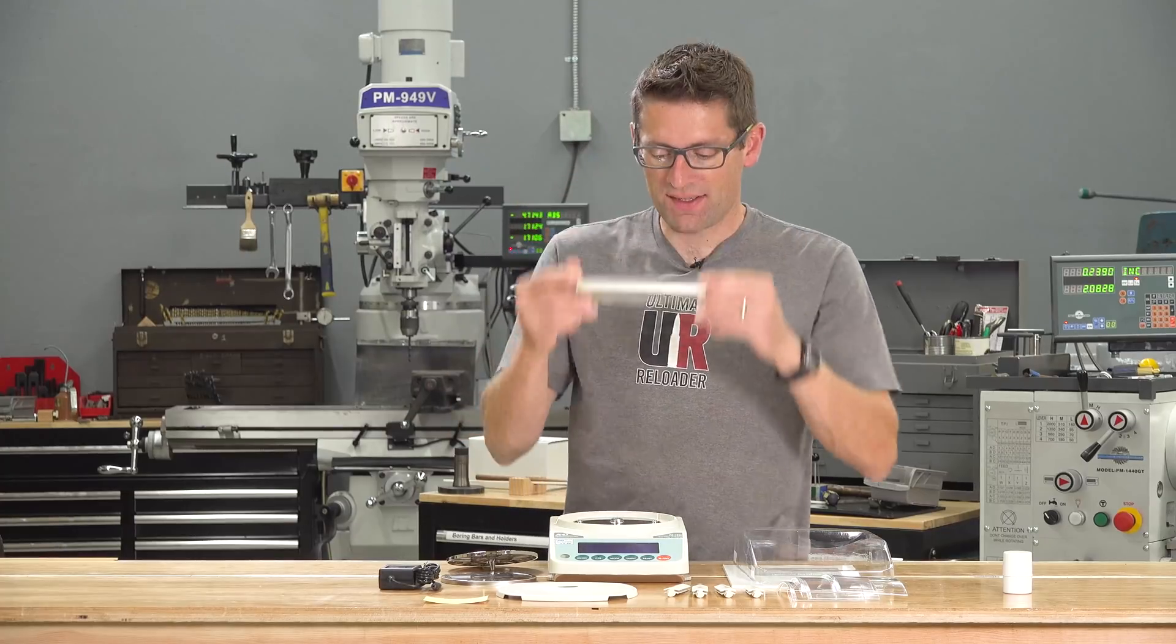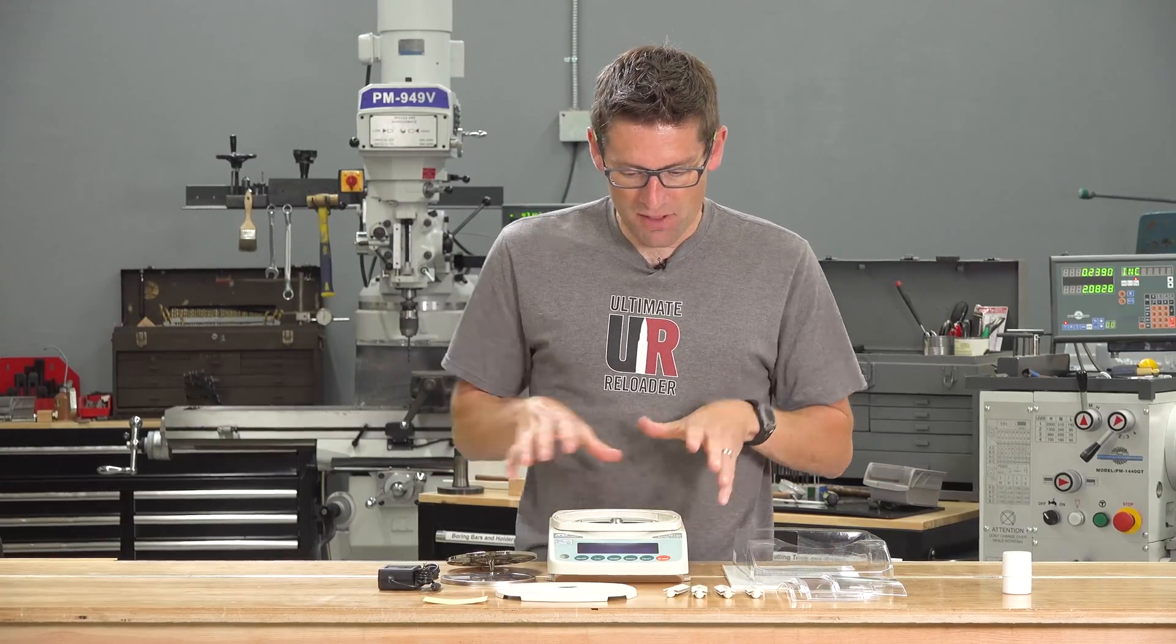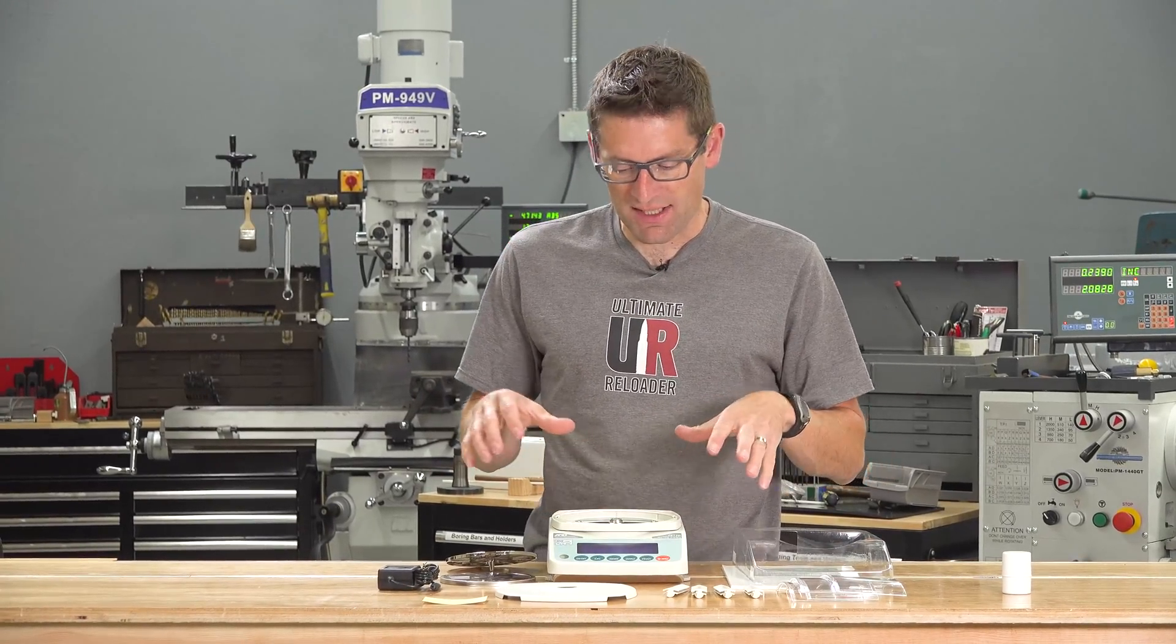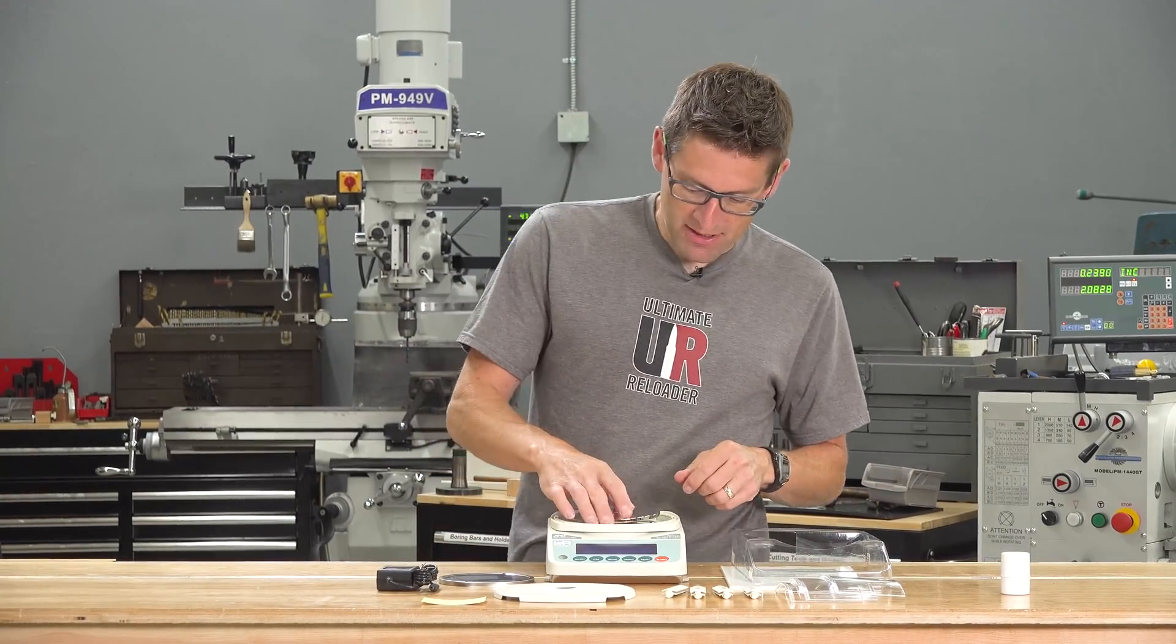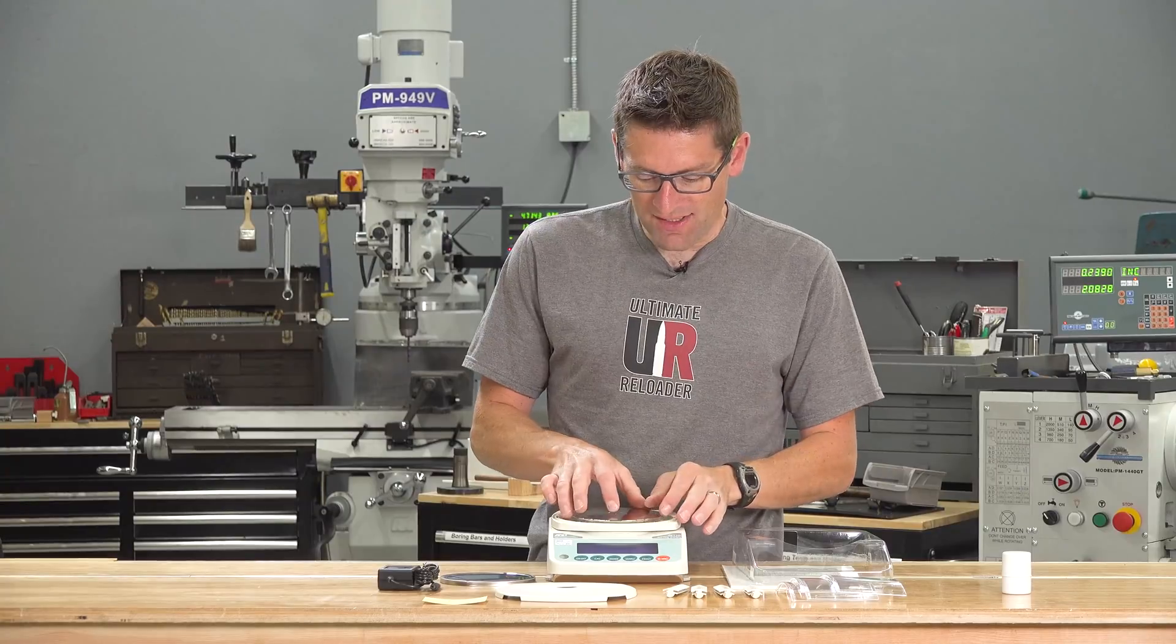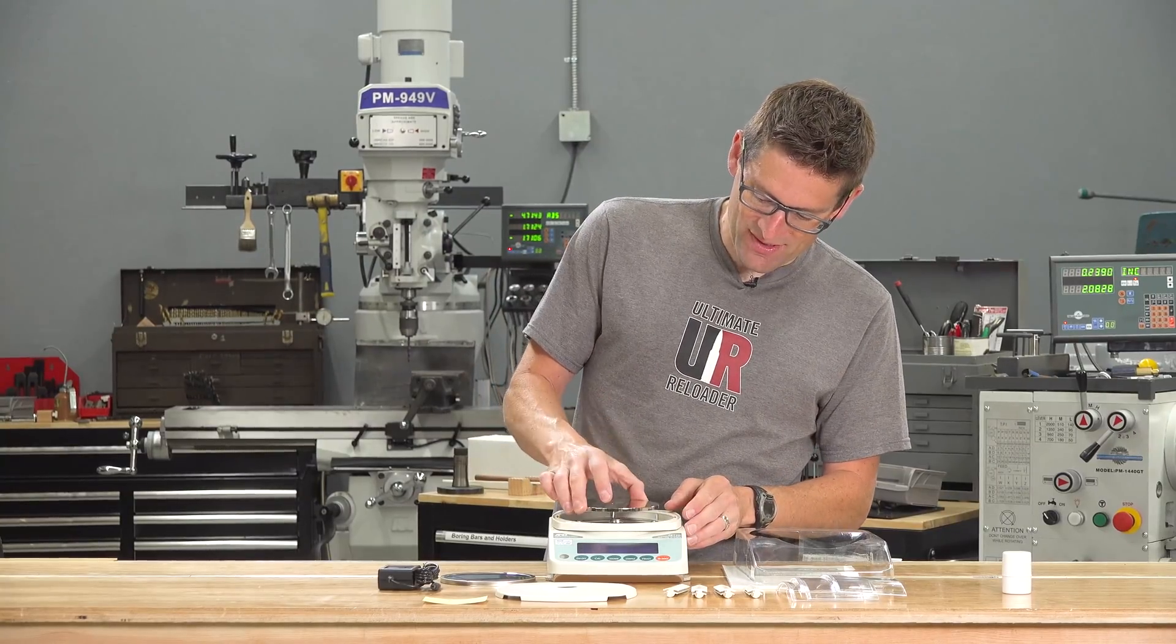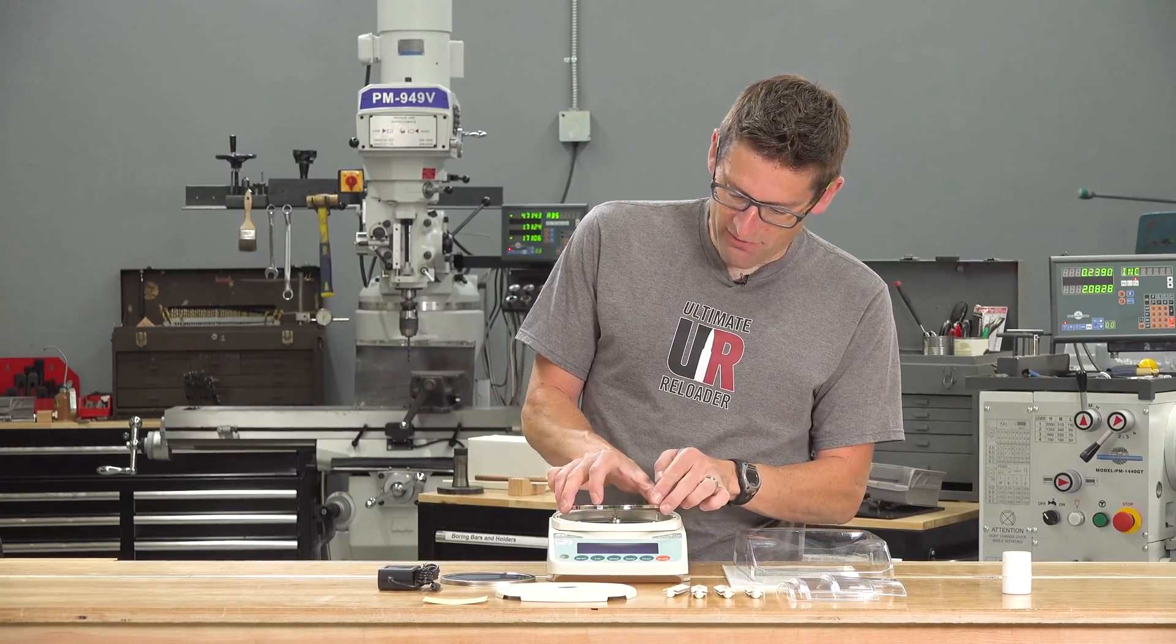This is the base of the whole enclosure assembly. And again, this is to keep air currents from interfering with the pan and the corresponding measurements, because this is such a precise scale that you have to be careful about that.